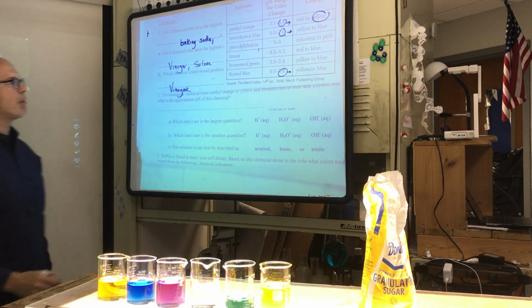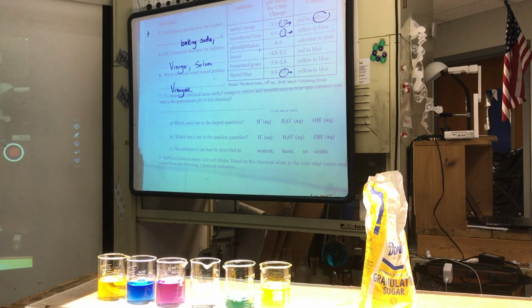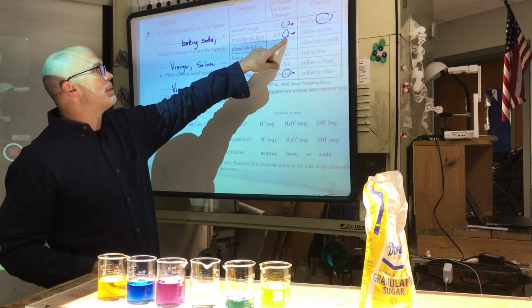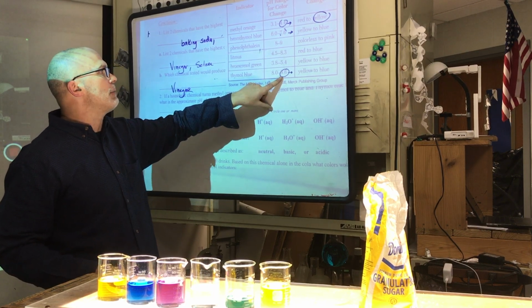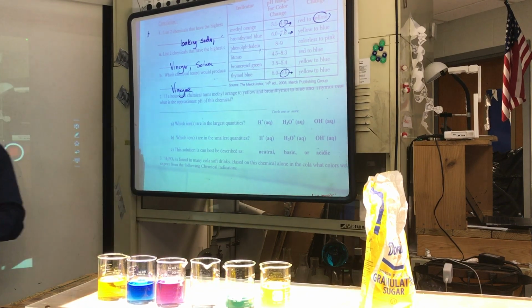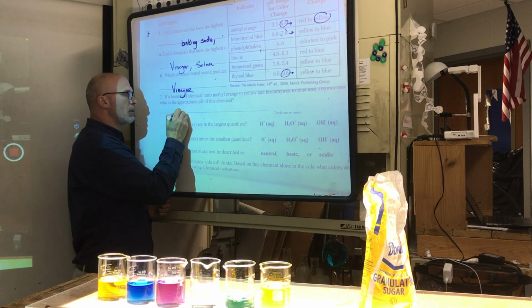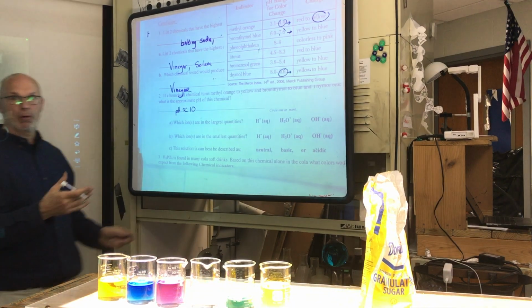What is the approximate pH of this chemical? Hey, come on, pay attention. Methyl orange is going to yellow, that's 4.4 or higher. Bromothymol blue is going to blue, that's 7.6 and higher. Thymol blue is going to blue, 9.6 and higher. Like 10. It's a good number, because they're all above 9.6. So it's approximate. So the pH is approximately 10. Could it be higher? Sure.